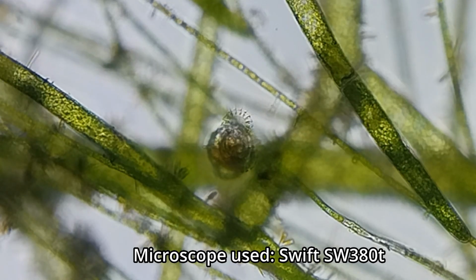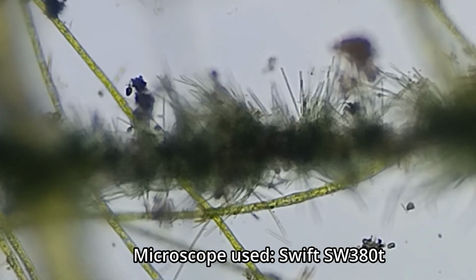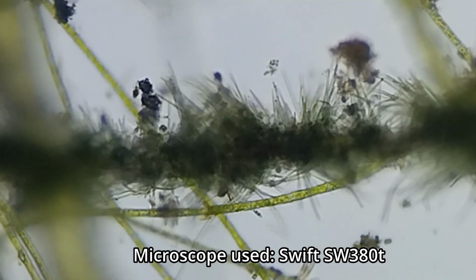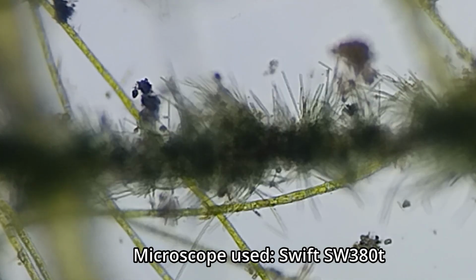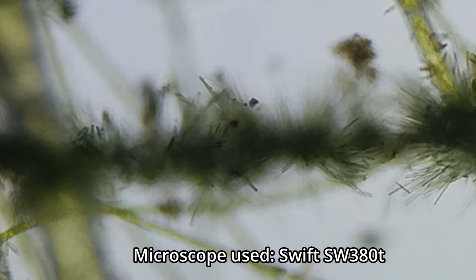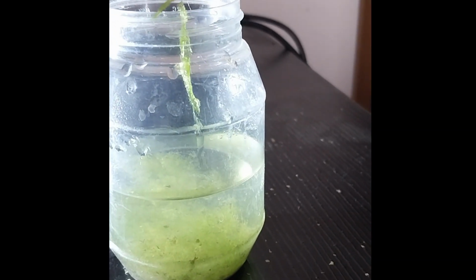This rotifer is filtering the water for food particles. Another noteworthy thing is that some strands of macroalgae are covered in cyanobacteria, which are photosynthetic, just like the macroalgae.